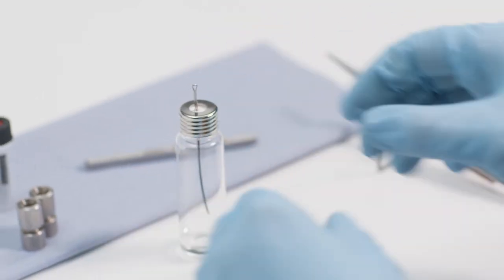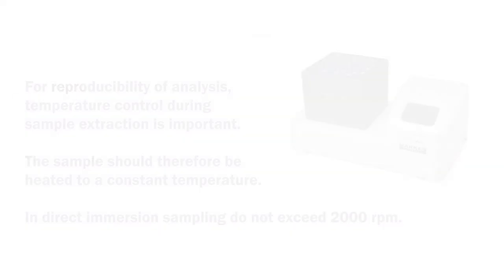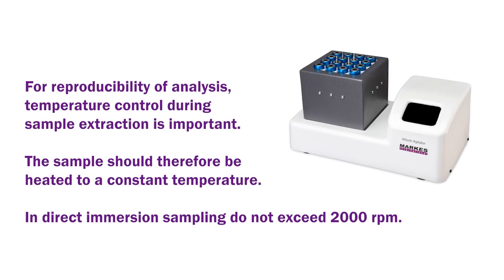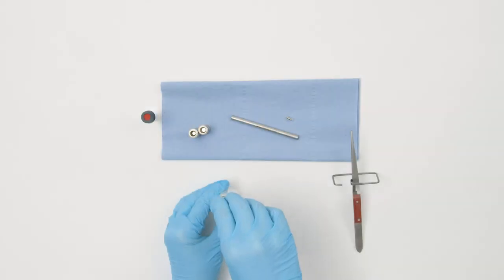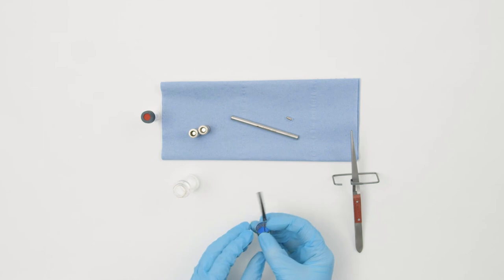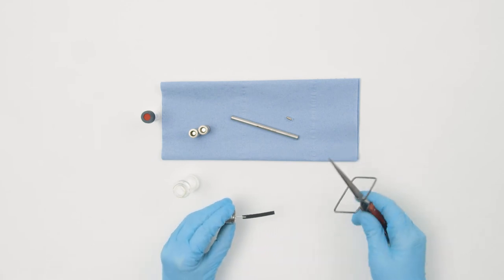Next, the sample vial should be magnetically stirred or agitated. Once sampling is complete, use tweezers to remove the ThinFilm SPEEME membrane from the sample vial.